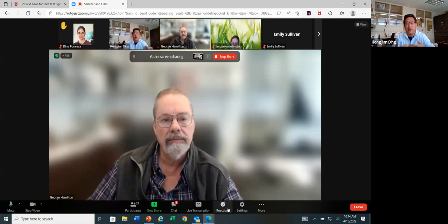So we come out at 90% or 95% accuracy. And this open system, like every unknown specimen we put in there, because you only have 15 species in the database, will come out as, okay, species A, with an accuracy of only 10 or 20%, because it's definitely not that species. Then we will tell the system, okay, this authentic identification is species C. So we will enter it into the system.